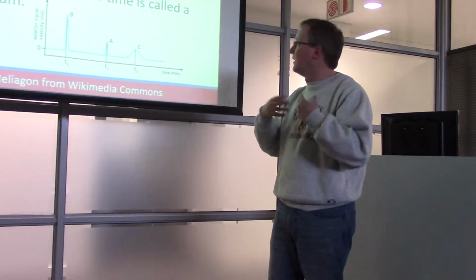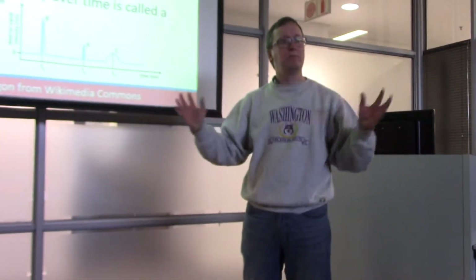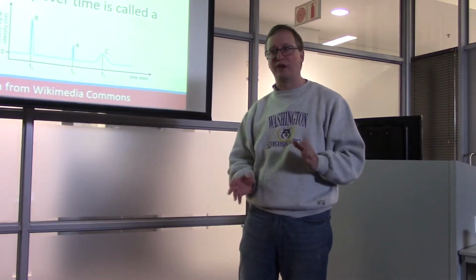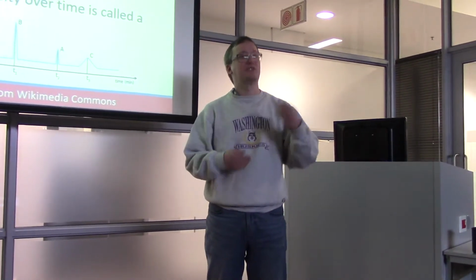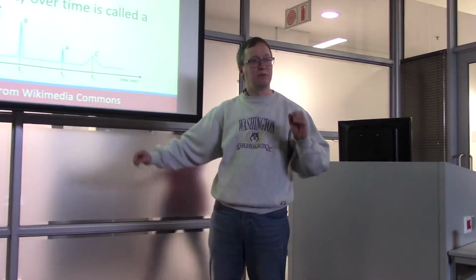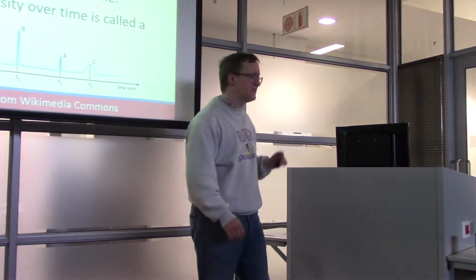So generally speaking, there's the possibility of complications where multiple ions could contribute intensity for a particular mass to charge value. But chromatograms are a very standard way for people to characterize how much of a thing you've got. Chromatogram is a concept that applies whether you're doing metabolomics or proteomics, so everybody should really have that concept.